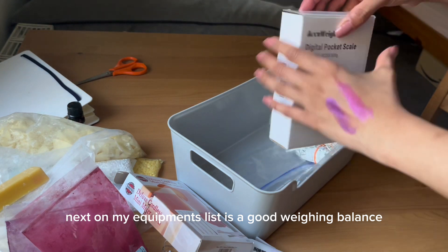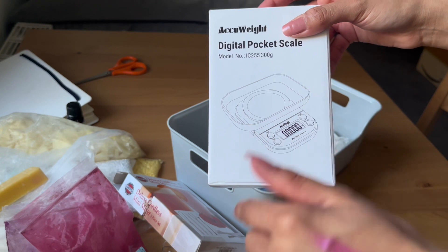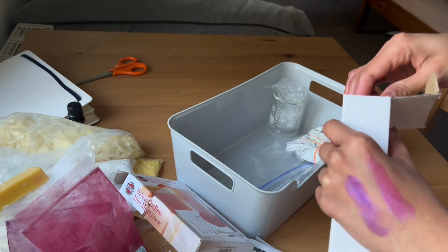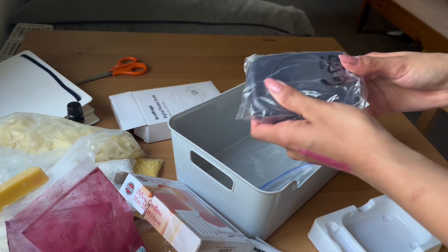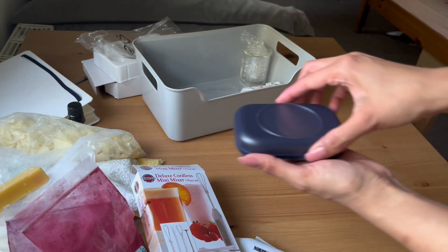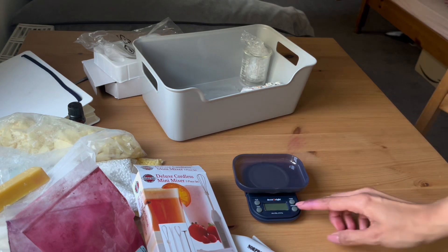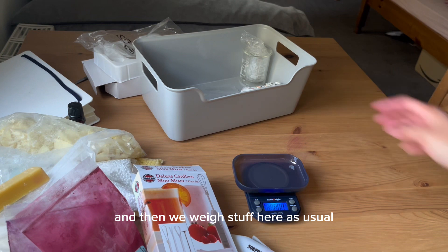Next on my equipment list is a good weighing balance. This has 0.00 decimal places, so it's much more precise to use, and it goes up to 300 grams. It works like this — and then we weigh stuff here as usual.